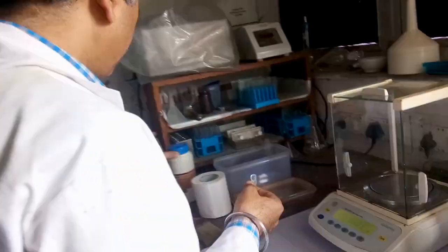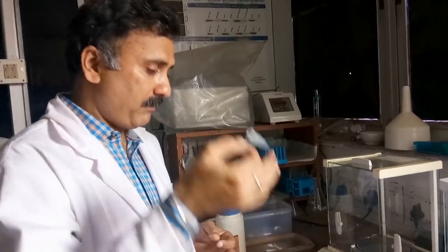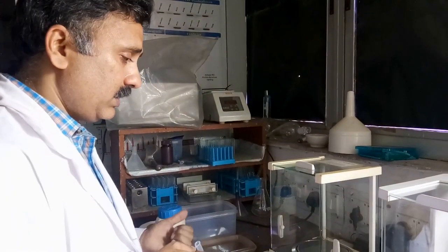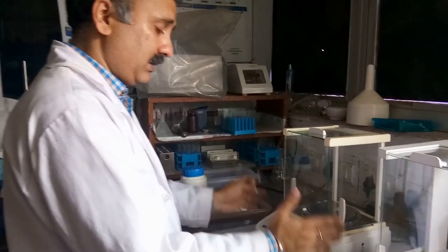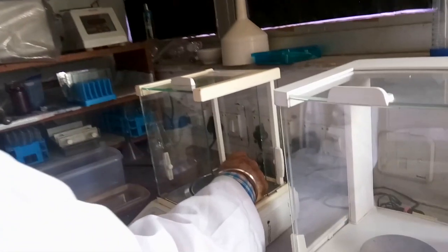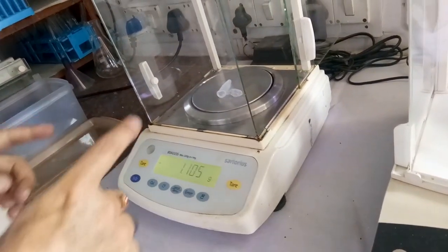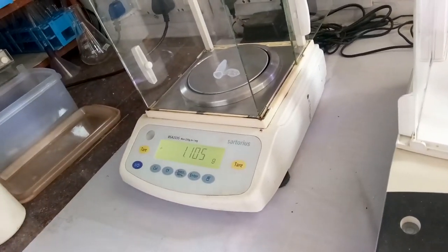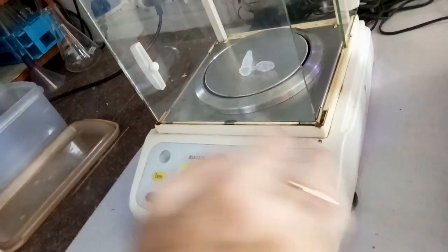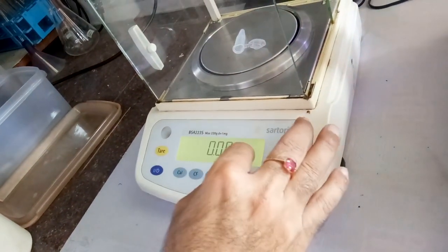Open one side of the glass door carefully, place your eppendorf tube on the pan, and the balance will show the weight of the eppendorf. To nullify this weight so you can measure only the glucose, press the tare button. This makes the weight of the eppendorf zero, so subsequent readings will show only the weight of the glucose added.